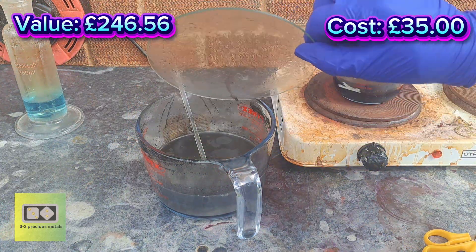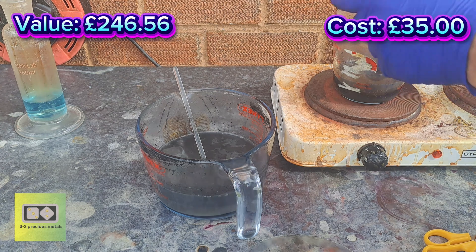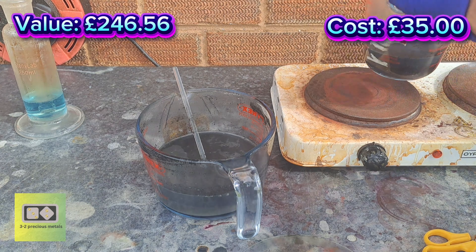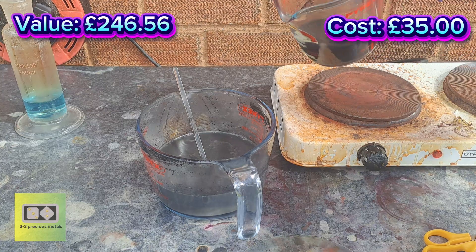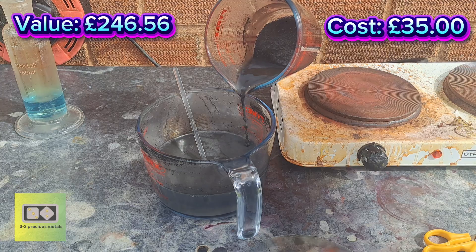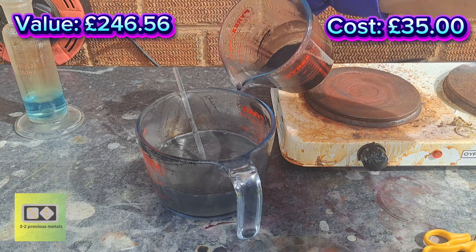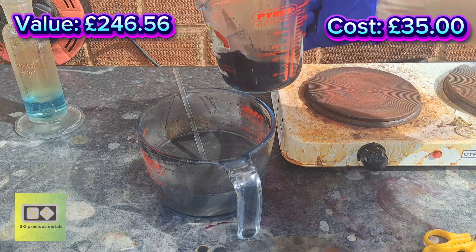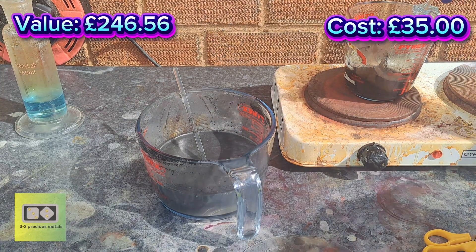Right, so the first round of reactions are complete — no more nitrogen dioxide gas. What I'll do is pour all of this nitric off into the other reaction, just in case there's any free nitric in there — it will help dissolve all of the base metals. Then I can put some aqua regia in here with these ICs and see if there's any gold in there.